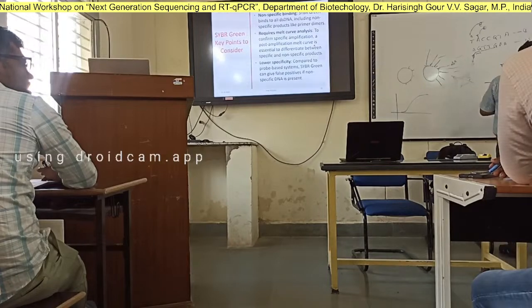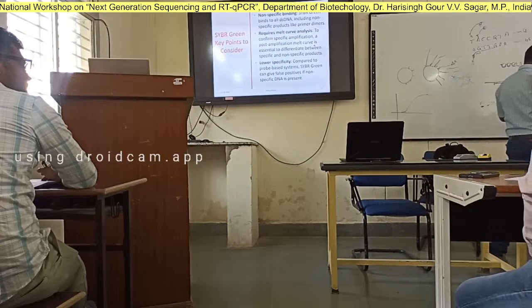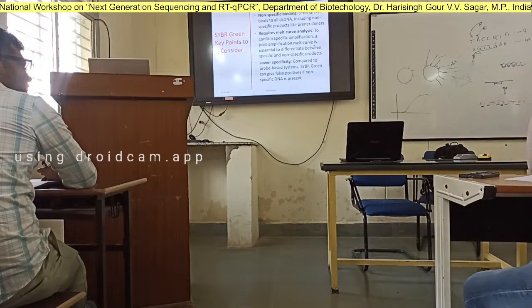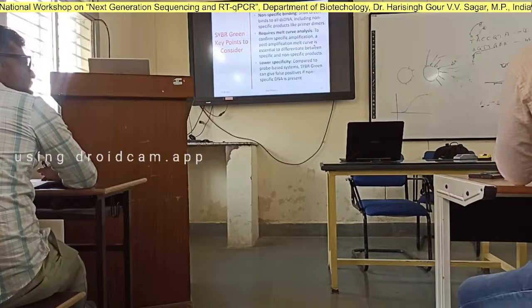If I design a primer that binds to exon 1 completely and exon 2 in between, तो इसको तो यहाँ पे भी binding site देगा, यहाँ पे binding site देगा, होगा क्या? One product will lie at 2 kb. Another will lie at 100 base pair or 200 base pair. 200 base pair is the RNA. The 2 kb one is actually the intron also got amplified.